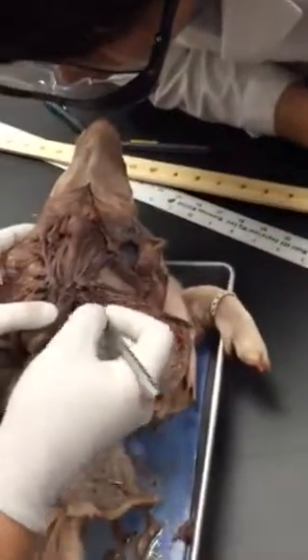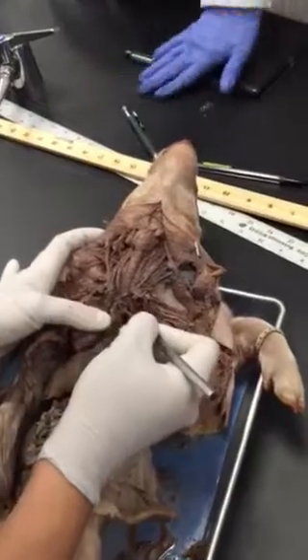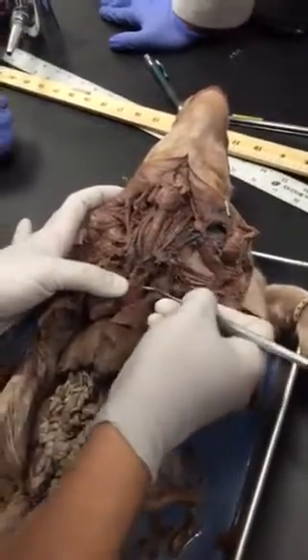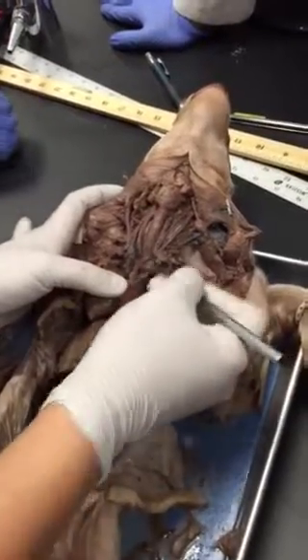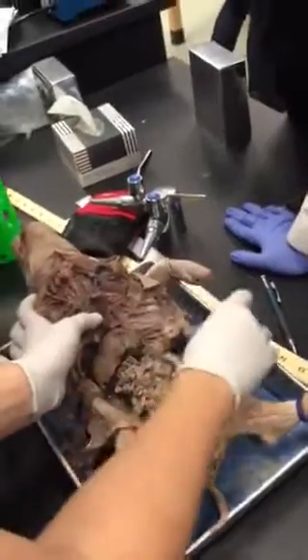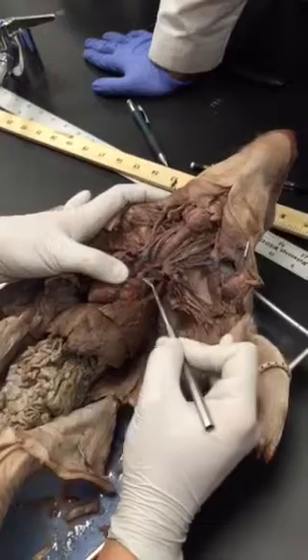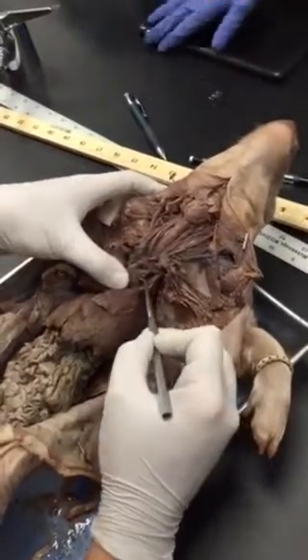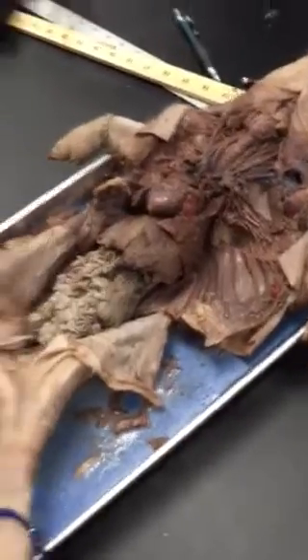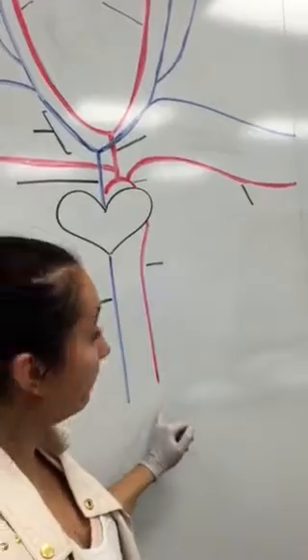So we're gonna look here, make sure, Justin, that other people could see too, okay? So here's the aortic arch here. You guys see that? Can you see that here? That's the aortic arch. So off of the aortic arch we see one branch here, we see two branches here, and then we can follow it and extend back underneath the heart, right? So that's what I've shown here. First extension, second extension, and it follows back behind the heart, right?